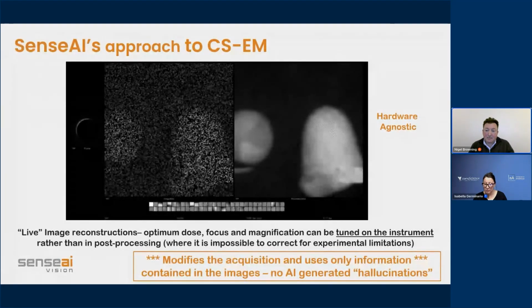And as I said, there is an error metric there in terms of how well they fit, and how many dictionary elements you need to get it to work. And this is very similar to what happens in JPEG compression. In JPEG compression, you can over-compress the number of patches you use to form your image, and then you lose spatial resolution. We all know that happens when we download an image from a website and it's been compressed. When you blow it up on your screen, it all looks pixelated.